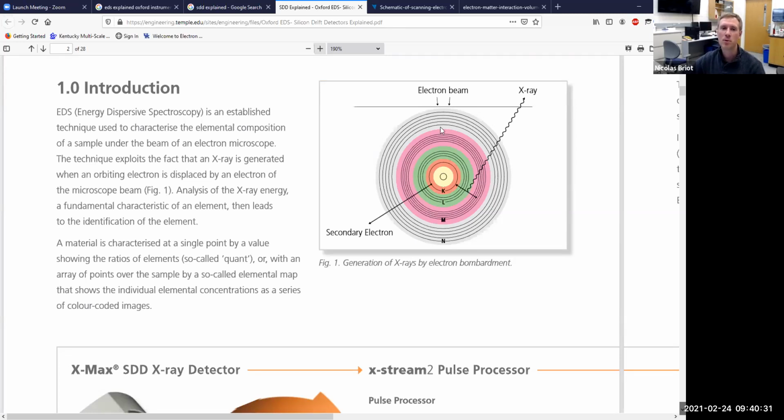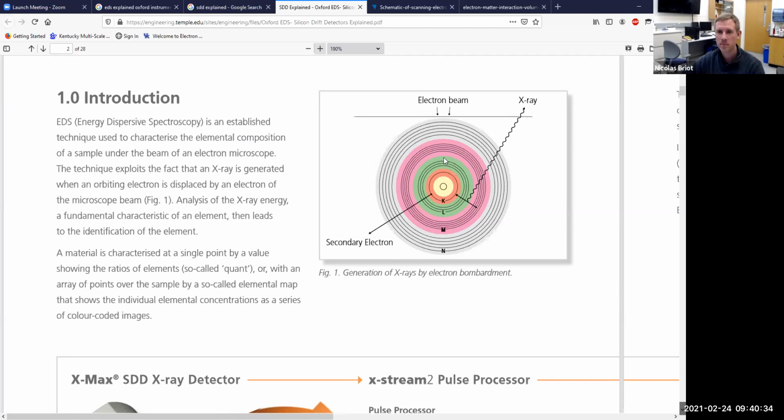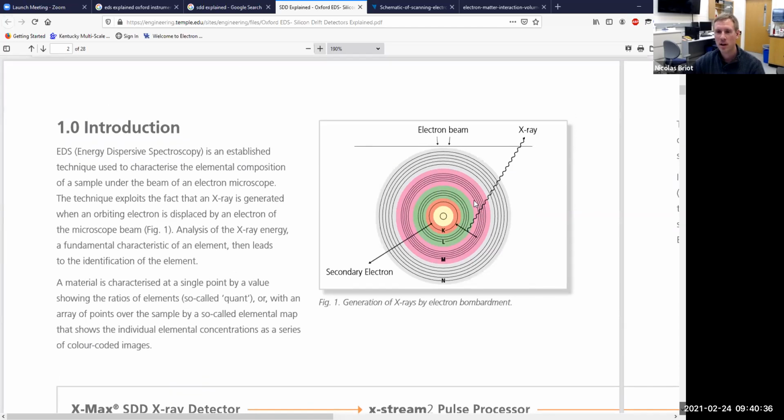So if you use the Bohr model to talk about an atom, you have the nucleus, and then you have those shells of electrons, K, L, M. When you shoot the electrons from the incident beam, if they are energetic enough, they can actually break some bonds here so that you can free some electrons from your atom and it flies away, okay? Like this one on the K shell. It's flying away. This electron is one of those that we capture that form the image, okay? So that's what we select with our electron detector. That's how we form the image.